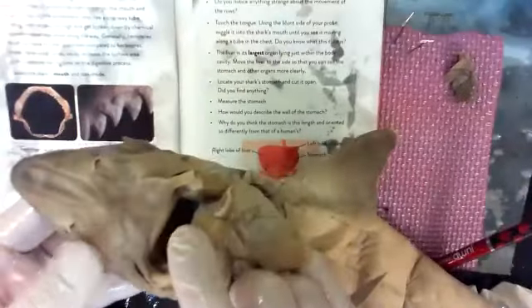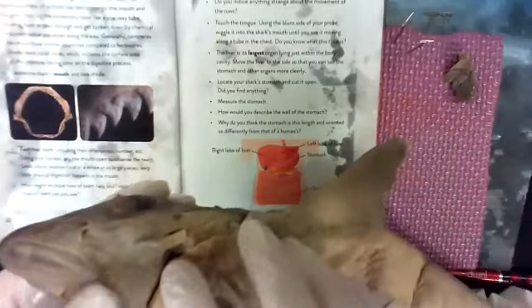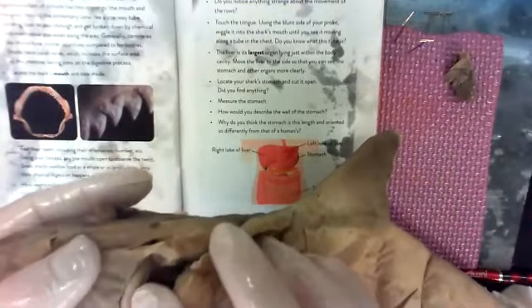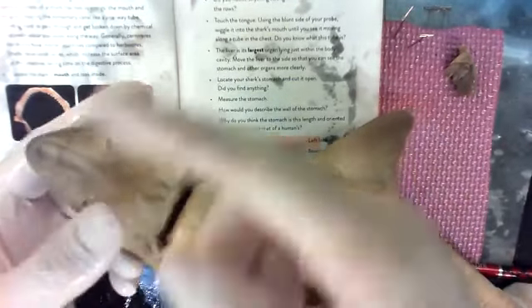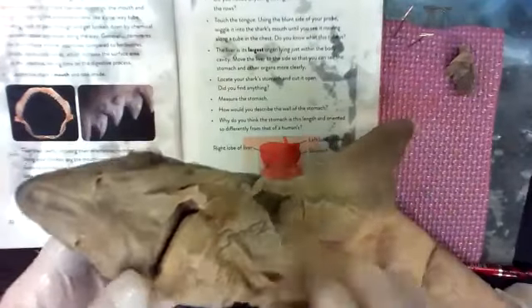Right. Digestive system, getting close to the end, yikes. All right, you already played with the teeth, count the number of rows. Teeth and skin, very much the same. Teeth are bigger, sharper, pointier. They don't get cavities. If they get a loose tooth, it pops out, and one of the back row teeth slides up into the place. They just rotate through. Crazy.